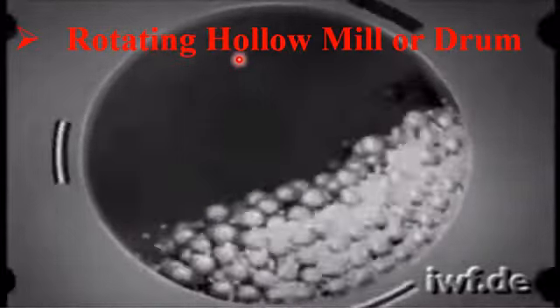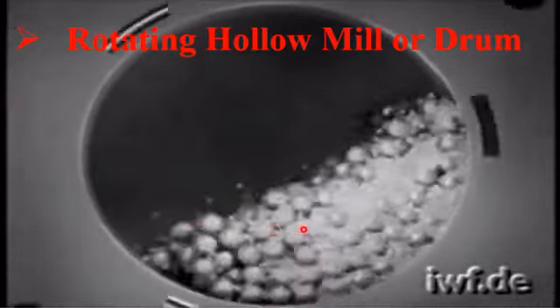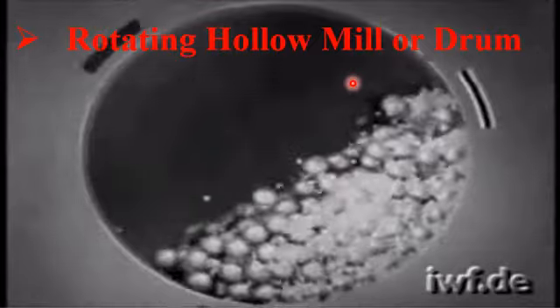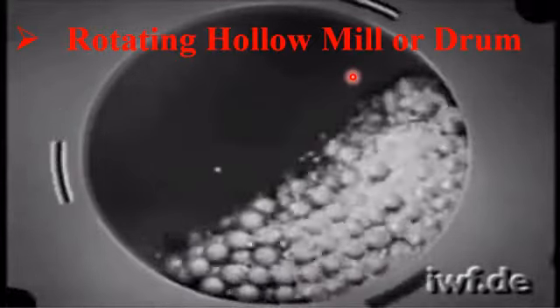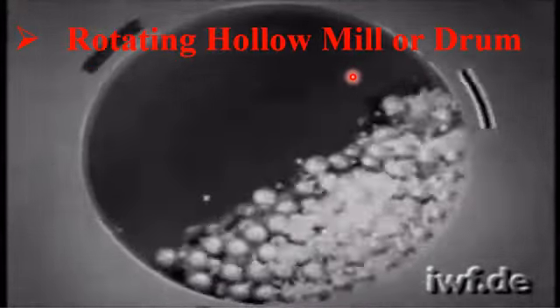Usually in a ball mill instrument, this hollow drum is rotated horizontally along its axis, and with the horizontal rotation and incorporation of the bulk material, the material is crushed.